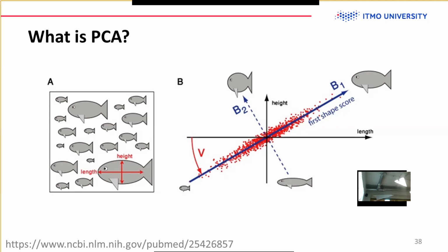However, if you look at this line along this long shape, from this we'll have a pretty nice understanding of both height and length, and maybe some other parameters as well.